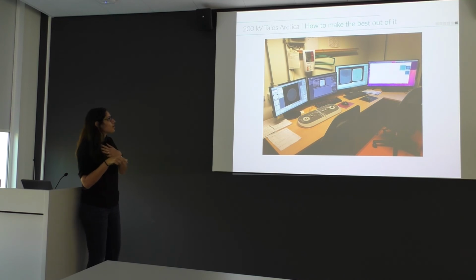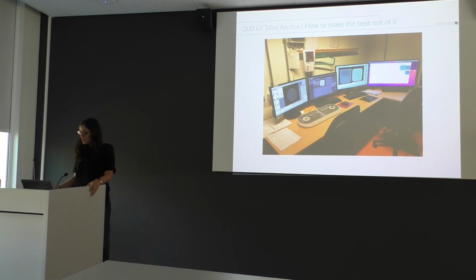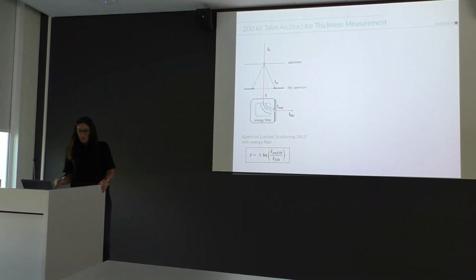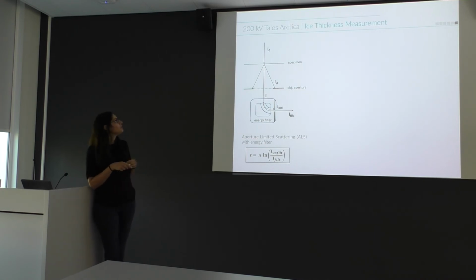So this is our setup. Those three screens are how you operate the microscope and how you operate the camera. We have a K2 with an energy filter, and on site we also have a powerful GPU machine. To make it as efficient as possible, we have, and this is fully Gert's contribution, an ice thickness measurement, and the way you do this is pretty simple.